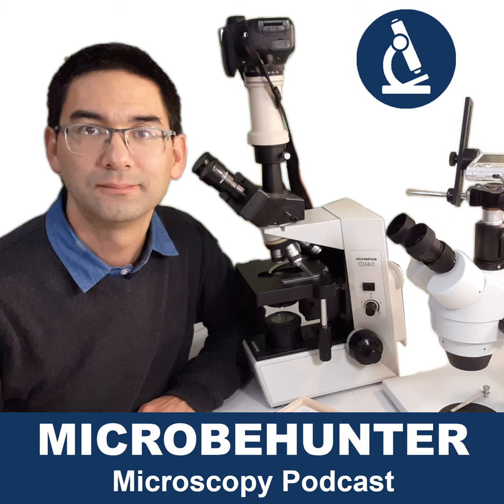I don't even know how this is possible. But they had to physically take the objective apart and give it a service and a cleaning because, somehow, oil went into the objective itself. That's not something that you want. And if this happens with a slightly lower priced objective, then I would say fixing it is not an option. You have to simply exchange the objective and buy yourself a replacement one.